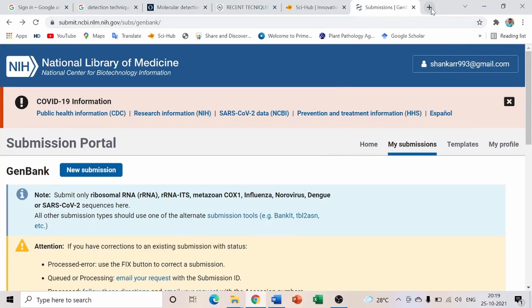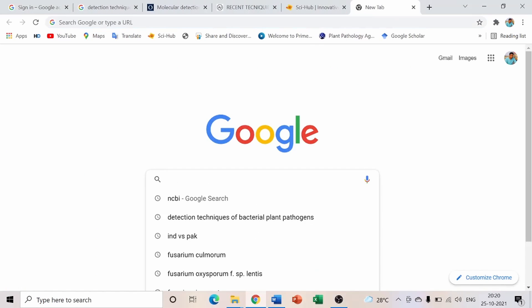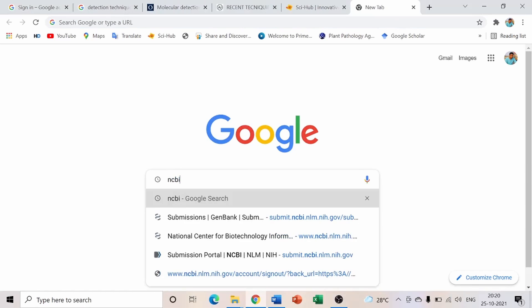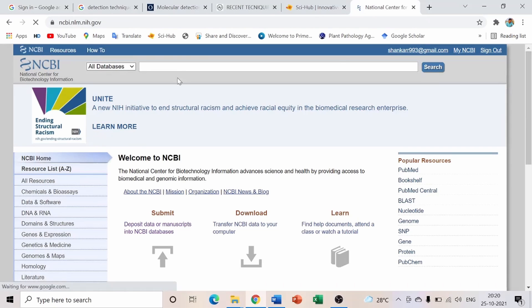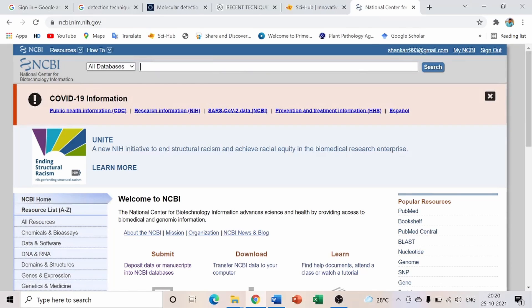Let me show you an example: during my MSc, I already submitted two sequences to GenBank. Go to NCBI, and in the database search, type your accession number — the one assigned after your submission is fully processed.